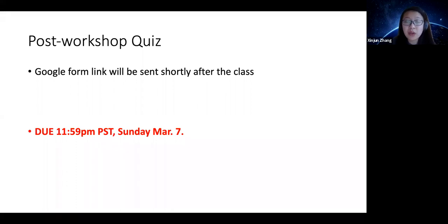If you're not getting a grade and you're just here to learn in general about GATK, those are not mandatory. But I think at least the assignment may be helpful for you to get some hands-on experience seeing how the GATK workflow works. Hopefully those will be helpful for you in your own research.